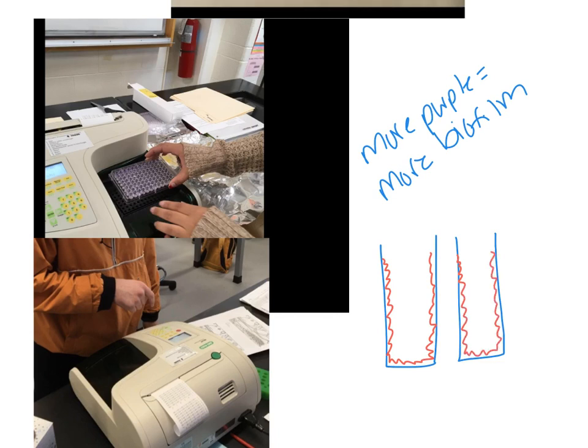So we've got our 96 well plate. I'm going to show you just 2 wells here. Inside of those wells, there might be some biofilm, and that biofilm is now currently stained purple with the crystal violet. The way that the plate reader works is that it shoots beams of light through the bottom of the wells, and there is a detector up at top that can detect how much light was blocked by the sample.